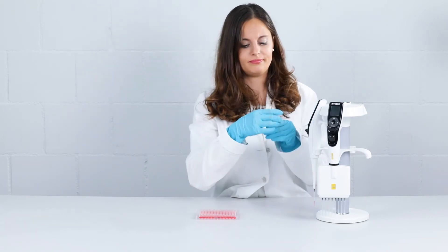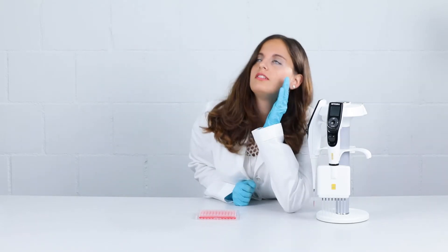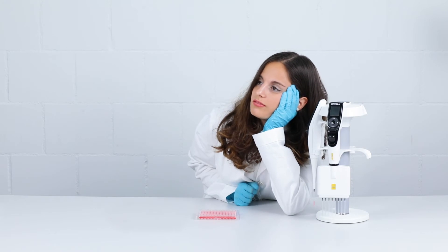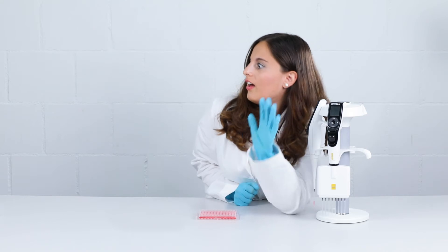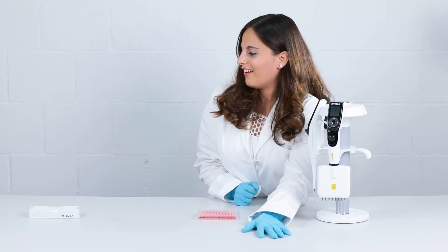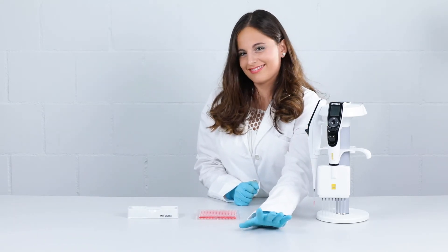The solution has just arrived. Say hello to Integra's divided reagent reservoir.